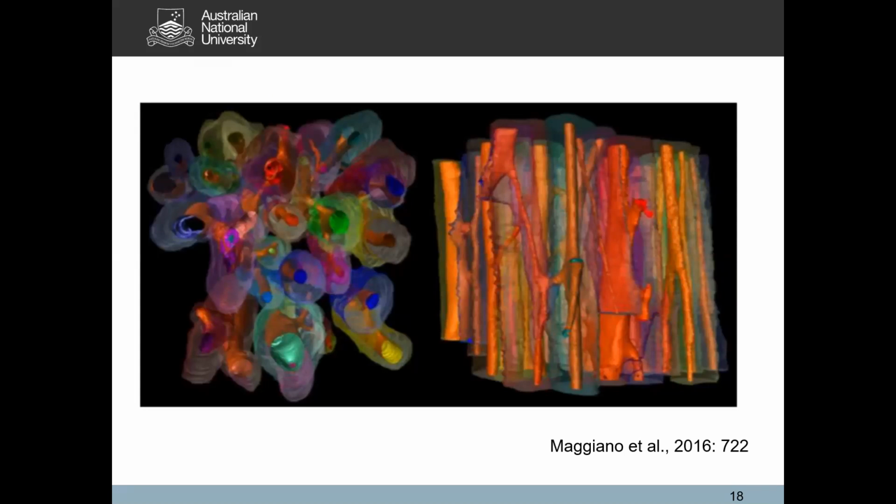So obviously thin sectioning is gold standard in clinical practice and in various other biological research and medical areas, because it helps us with diagnosis. It helps us to access cell structures and visualize microstructures generally. But when we're talking about the vasculature of bone, remember that it is a 3D feature. So what's becoming increasingly clear in biological anthropology, especially when we're trying to make inferences about bone remodeling, is that wherever we take the thin section from, it's not entirely representative of the bone chunk that we're studying.